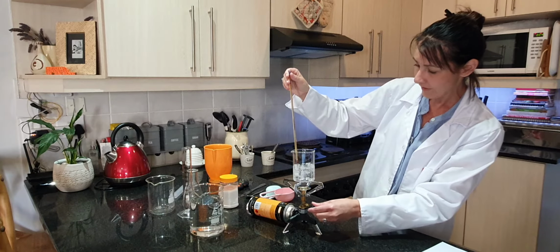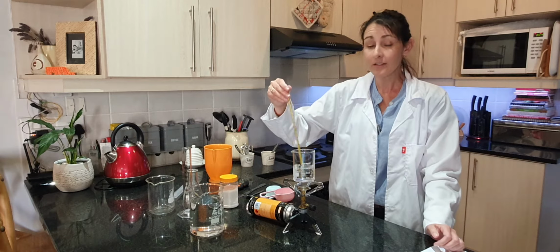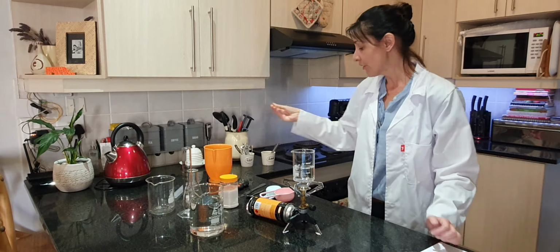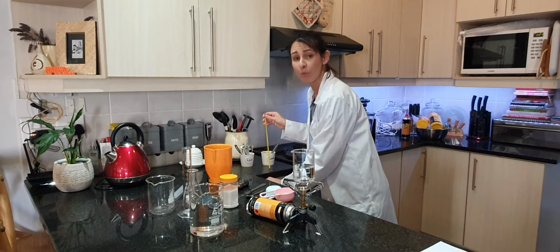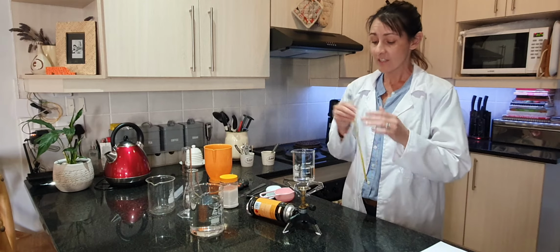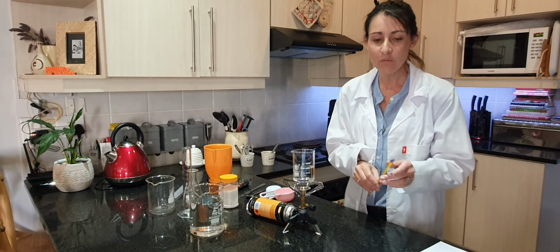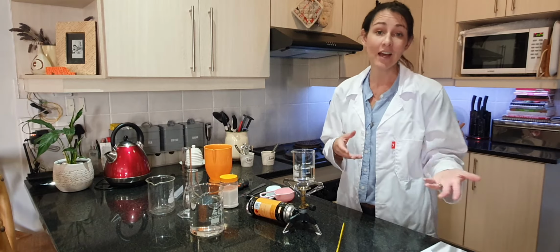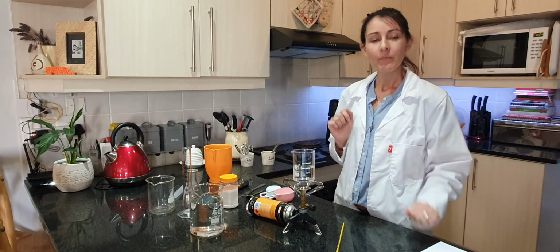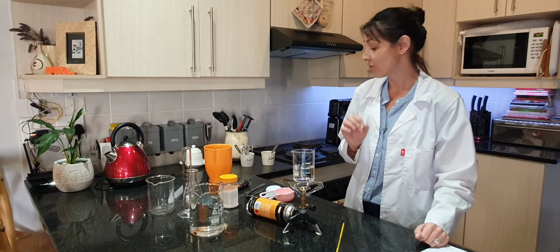I'm just going to switch off the heat, and this temperature is now just a little bit more than 100 degrees. So it is safe to say that you can take the boiling point as 100 degrees. So usually water's boiling point is 100 degrees Celsius, and this one started to boil at about 99 degrees, so it's so close. But in your table you can put actually either 99 degrees Celsius or 100 degrees Celsius. That's fine. So boiling point for 150 mils of water is 99 or 100 degrees Celsius.